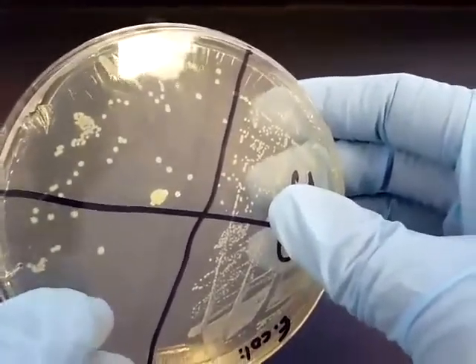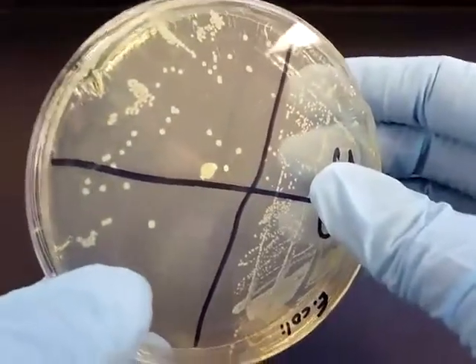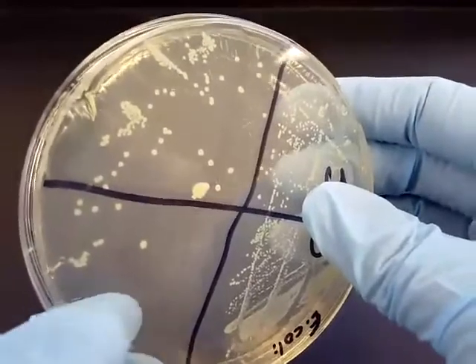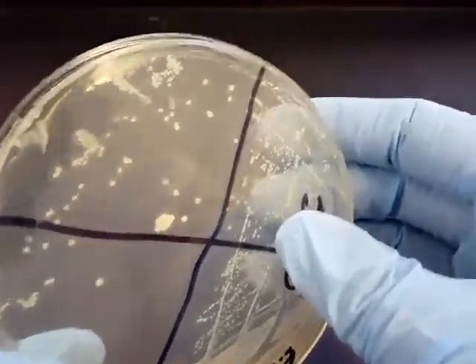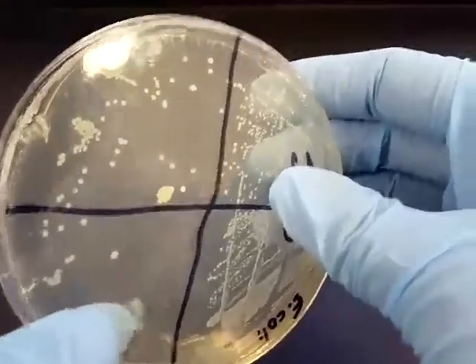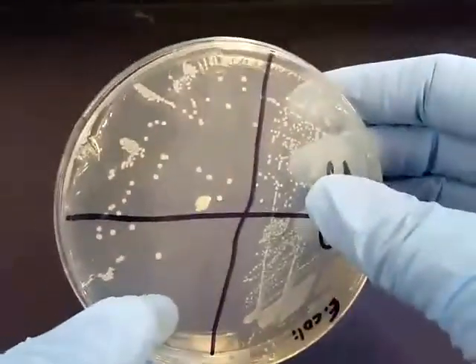Unless it's going to be cultured from what we know as a sterile site, cerebral spinal fluid should probably only have one microorganism in it if the patient has meningitis. If they have multiple microorganisms in there, then they're probably in really bad shape. So this is what isolation looks like.